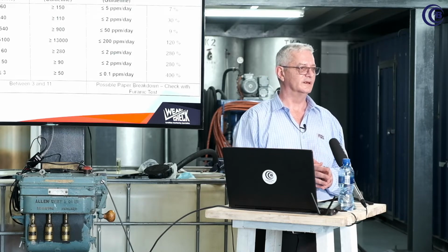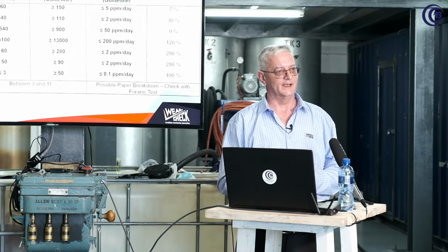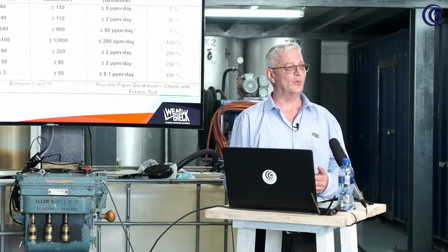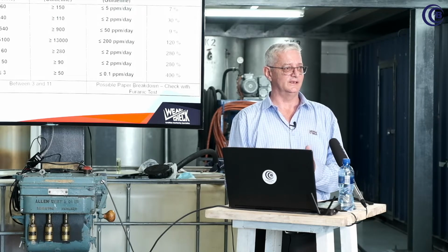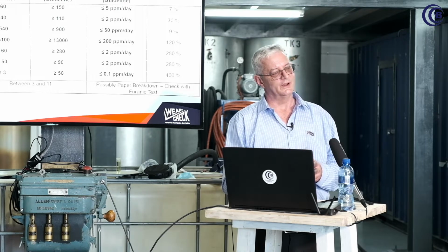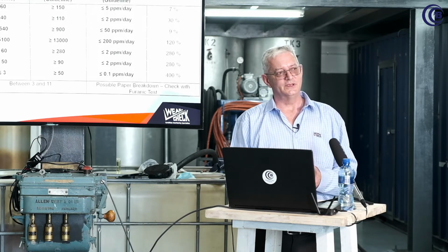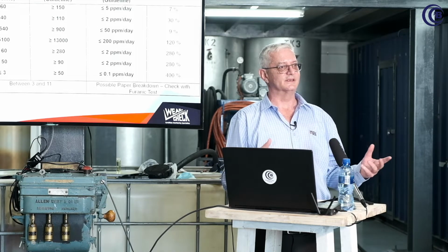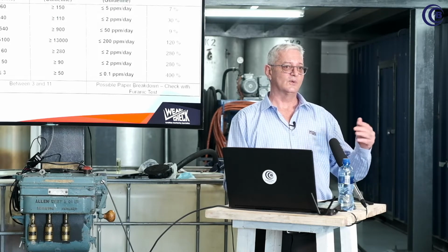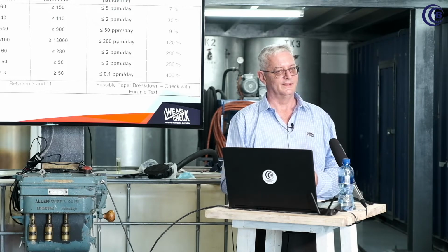What is important with gases is how much gas is generated by a transformer per day. Most transformers are generating gas, and you even get oils that have a tendency to generate gas. That's normal in a transformer. What we want to know is how fast that is happening. So when you get down to the diagnosis, you look at trends of transformers and you look at the whole history. And it's quite important to look at the industry that the transformer is in eventually.